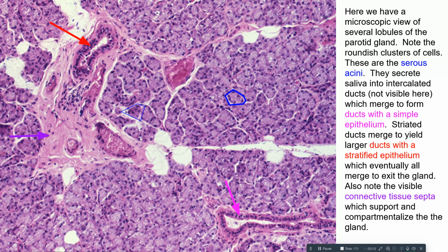All right, that is one organ done. The tongue is done. And now what I'm looking at is the parotid gland. Remember, that is an extrinsic salivary gland, sort of over by the ear, kind of like sitting on the ramus of the mandible. And what I'm seeing here are just several lobules. This is a lobule of the parotid gland. There's another lobule up top, another one over here, another one right here. I see connective tissue that's separating the lobules.